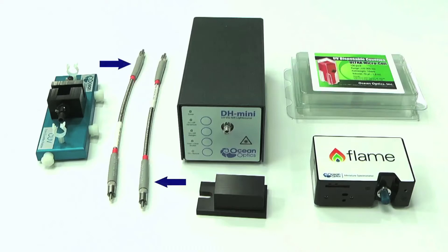Two premium 400 micron solarisation resistant fibres. Each is 25cm long and features metal BX jacketing, helping to protect the fibres by preventing over flexing.